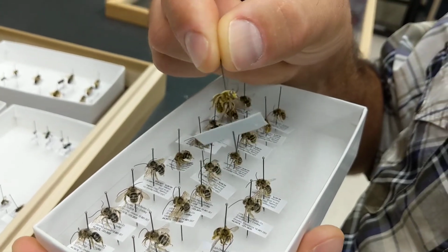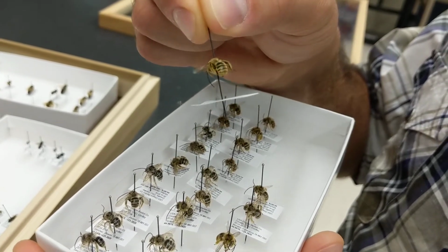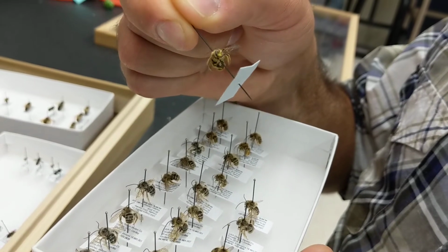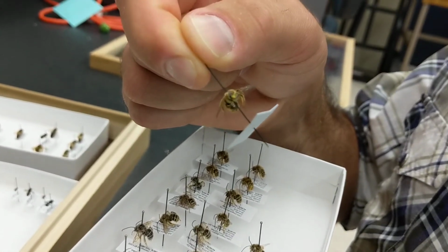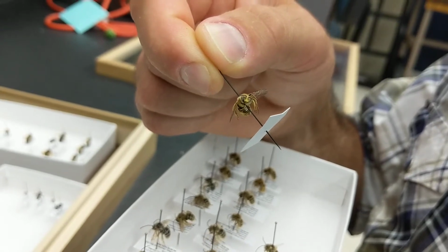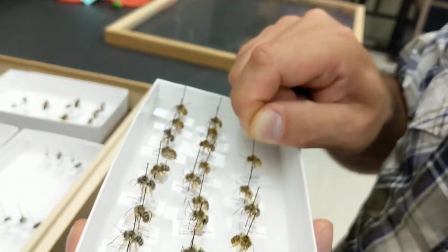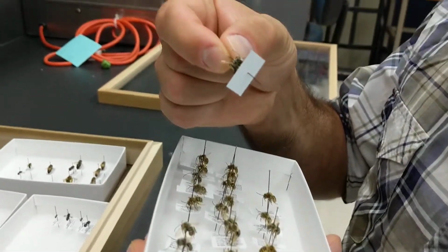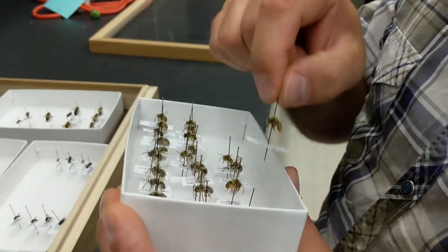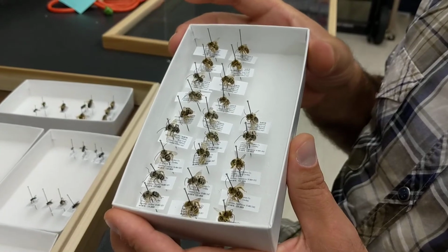And so maybe those are two different species, so we can look for other characters that might support that suspicion. We can look at the extent of the yellow on the face, because these male bees have a yellow maculated clypeus. So I can just take a quick eyeball at that and then compare that to one of the males with a lighter pubescence, and it looks like maybe they're just a single species with some variation in the hair color.